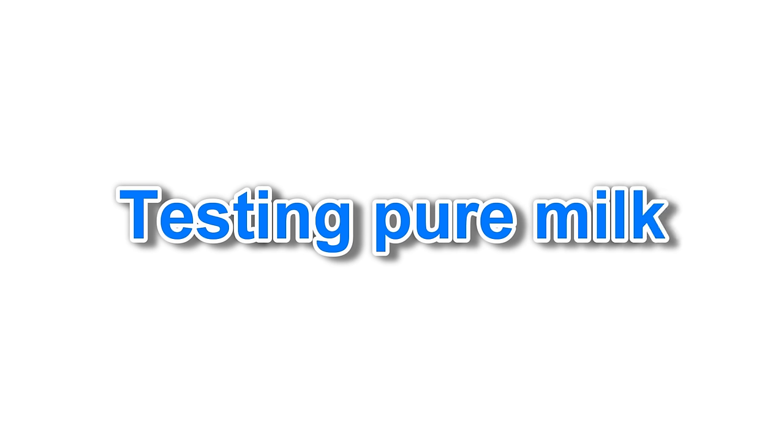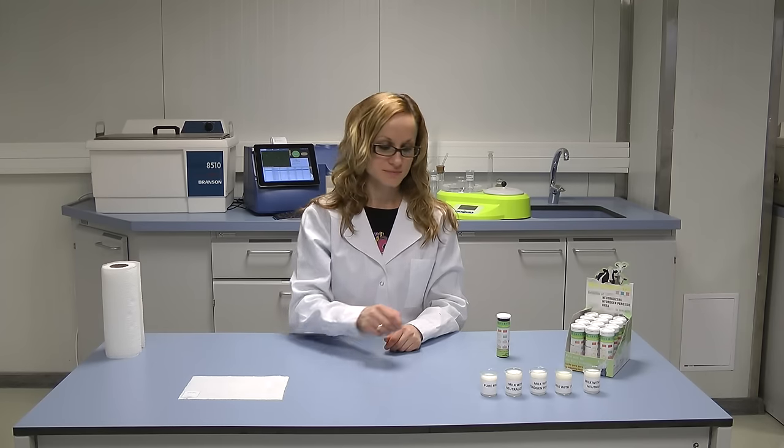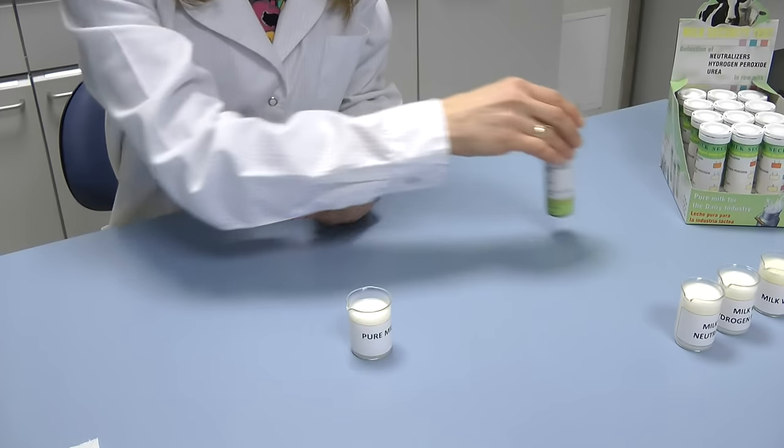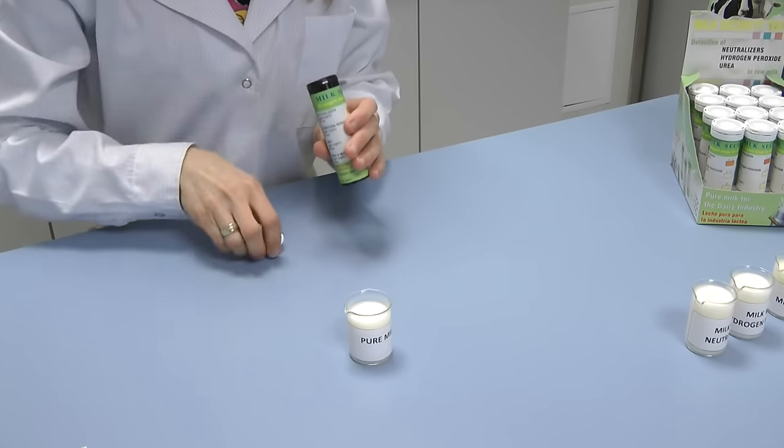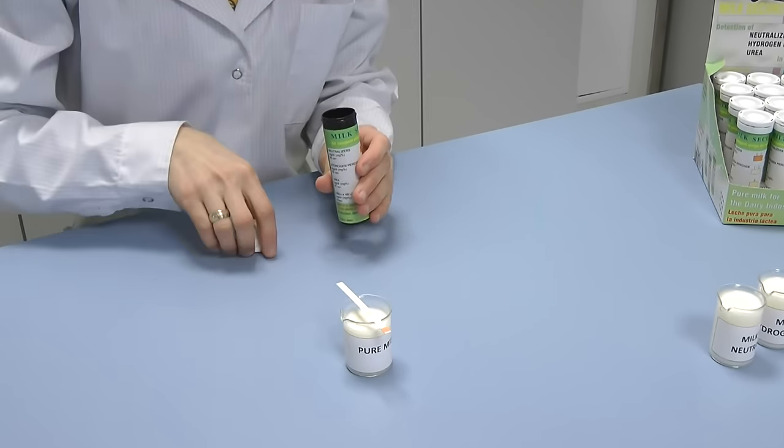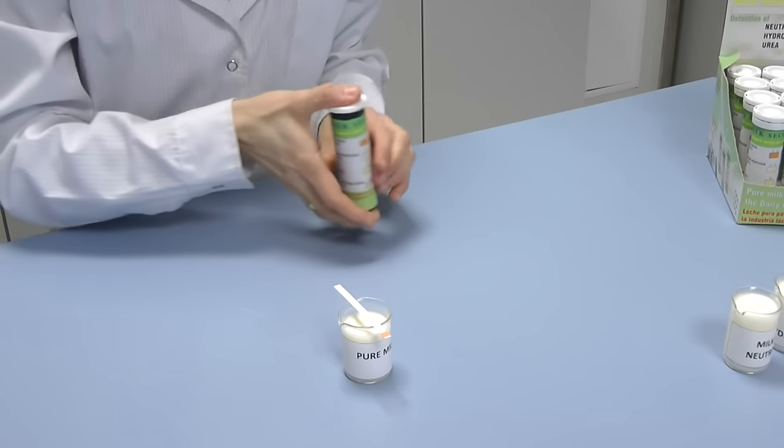How to use? First, test pure milk without adulterations. To do this, open the cap of the test tube. Take one test strip for testing, then immediately close the tube.